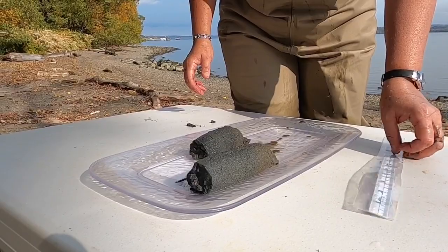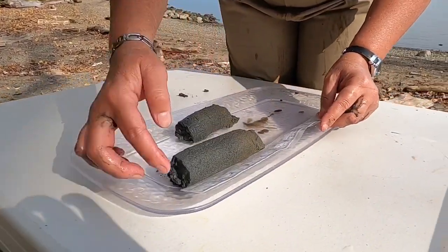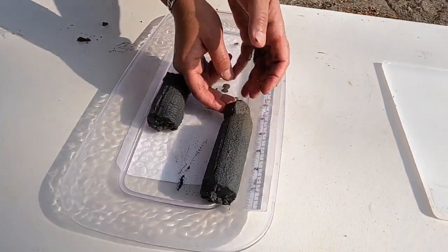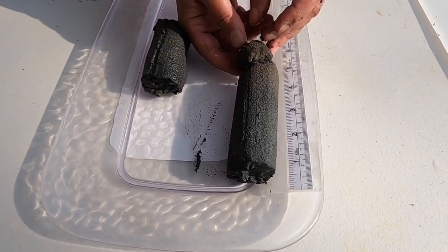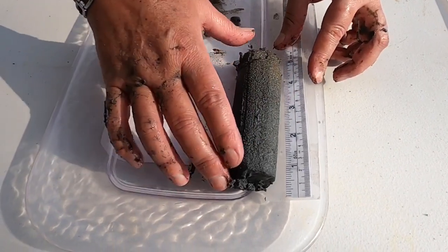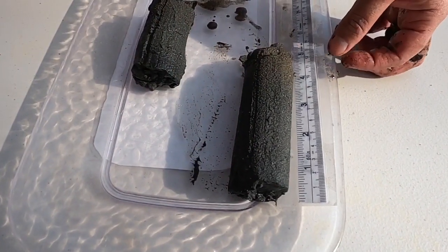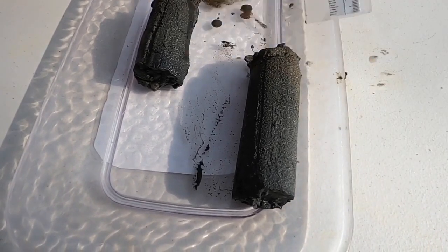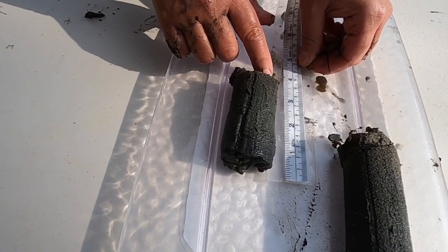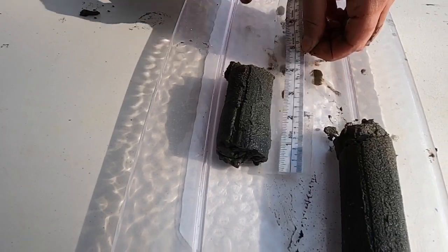One of the things we want to do is measure the samples. This one is approximately four and a half inches, or eleven and a half centimeters. The second one is about three and a half inches, about eight and a half centimeters.